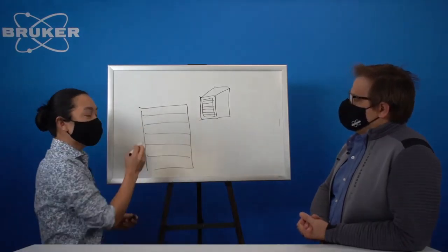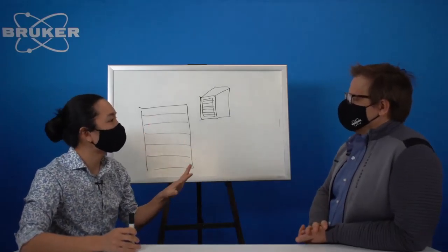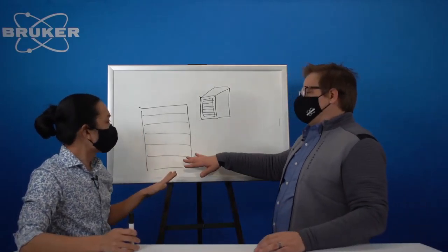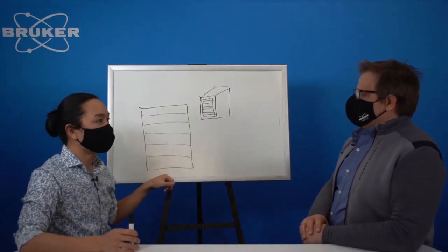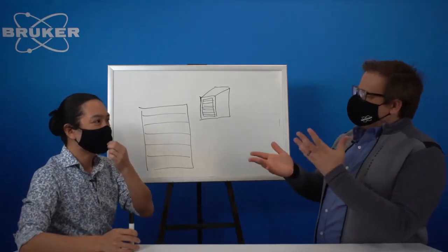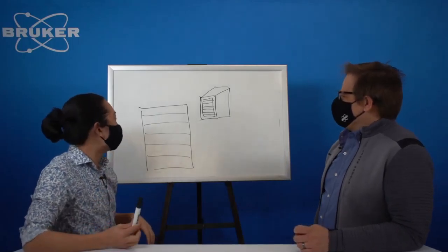Conveniently, the size of this is optimized around the same size that we would have seen with the scintillation counter. In our case, about 14 or 15, 16 millimeters for the total thing. And each individual strip is going to be about 75 microns. We'll talk about that special number, 75 microns. That seems very particular. It is. We're being very discriminating about the size of our strips here.